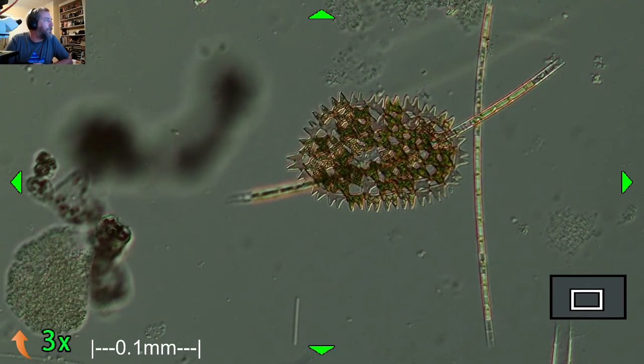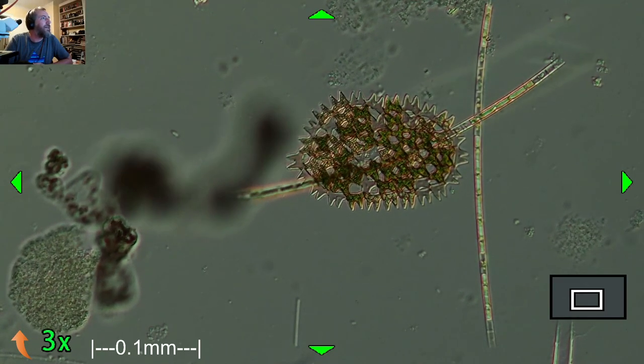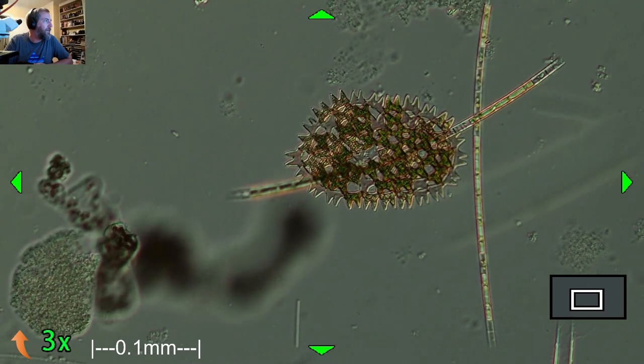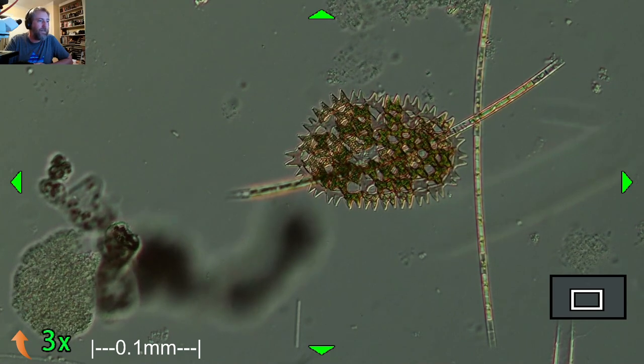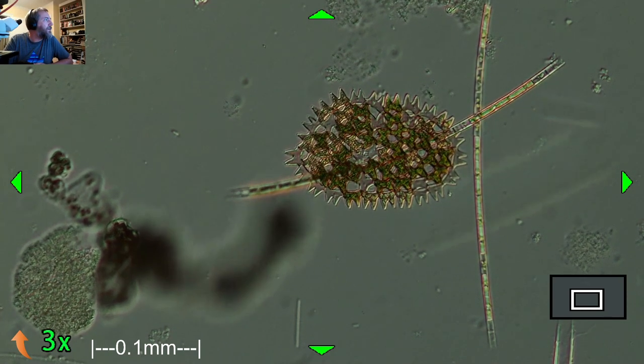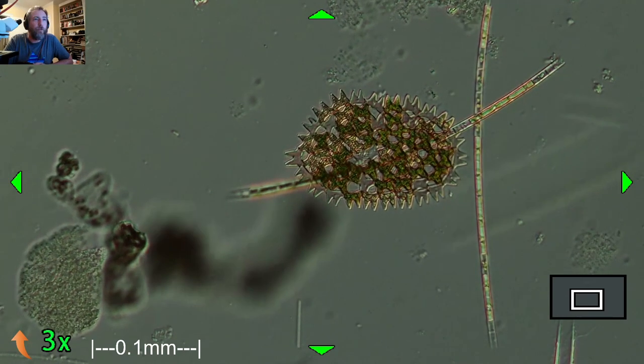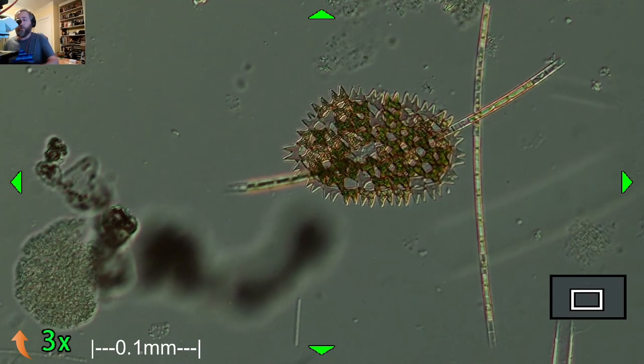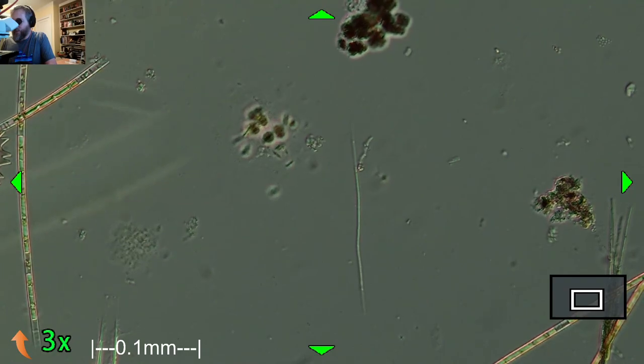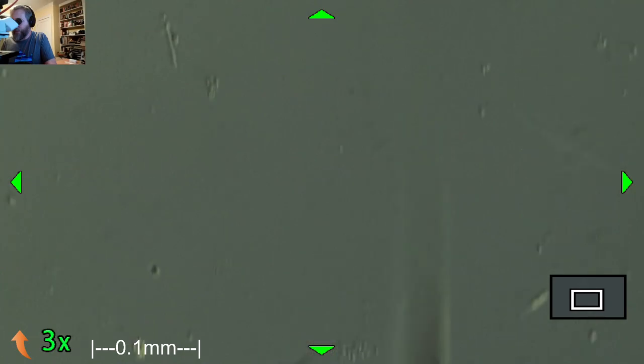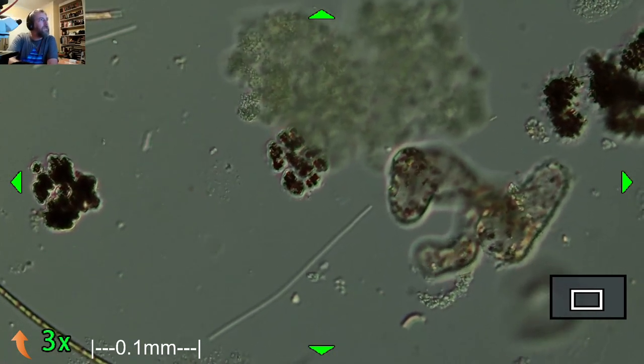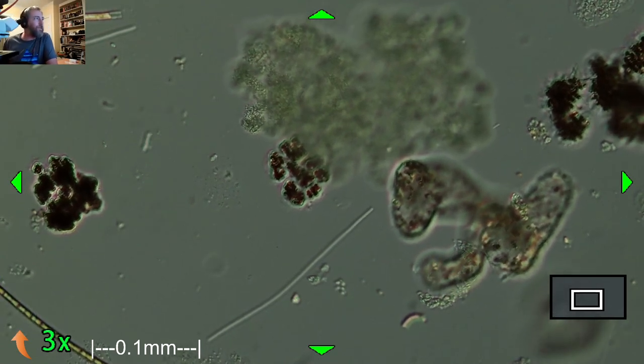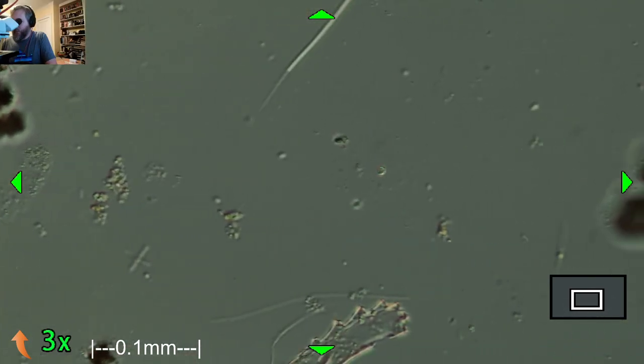Not sure why the music is jumping around in volume all of a sudden. It's super loud. There's a bunch of green algae in here. I think that's what this stuff that looks like it's in a sack here is. Yeah, Pediastrum is the ones that look like little kaleidoscopes.